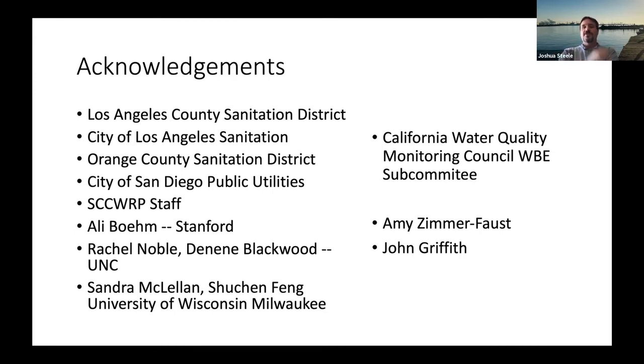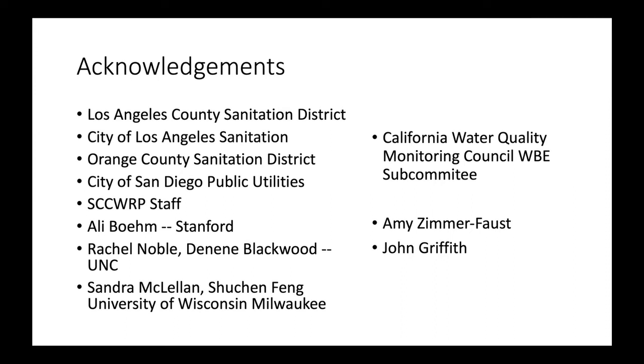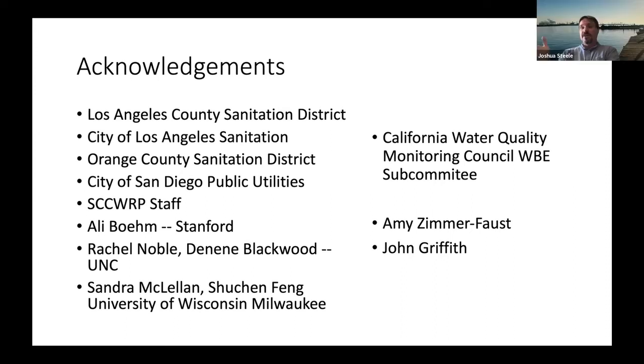So we actually use bead beating and mechanical lysis as well as chemical lysis to break them open and get to the RNA. But I've not seen anyone do a good test of free RNA versus viral capsid RNA in wastewater to see what the difference is. But I would expect it to get chewed up pretty quick. And inhibitors, yes, wastewater has lots of inhibitors. And that is one of the things we think is helping us with the sensitivity.